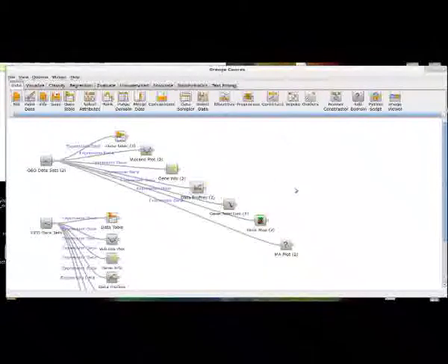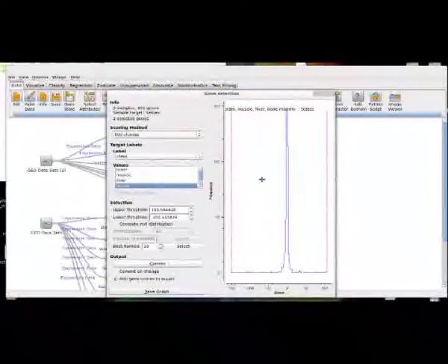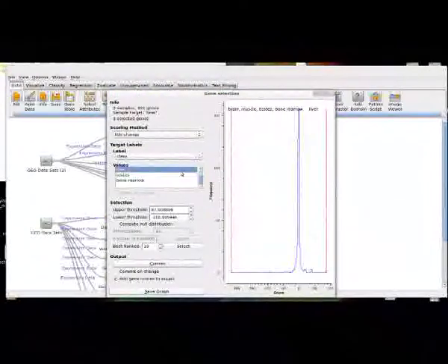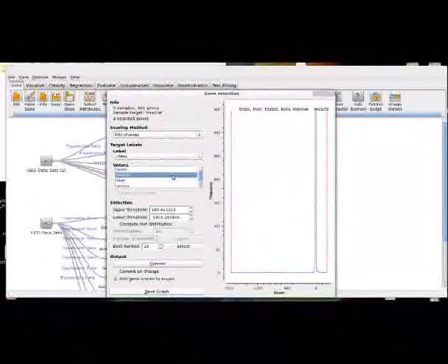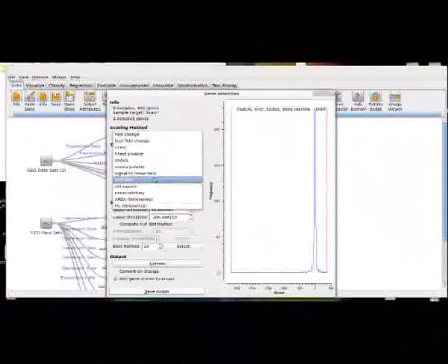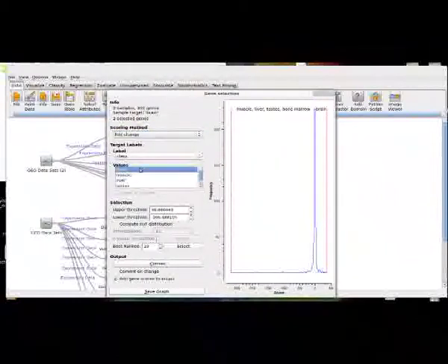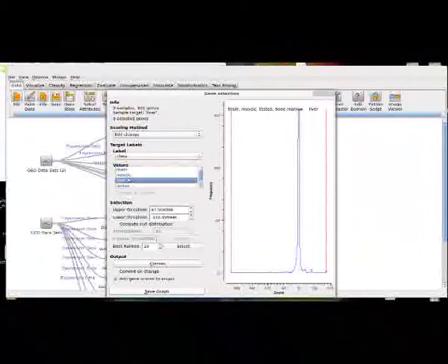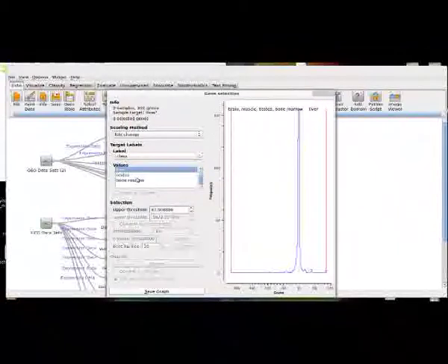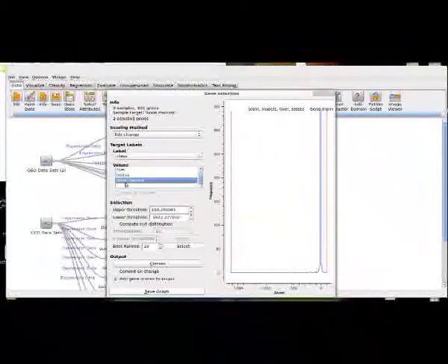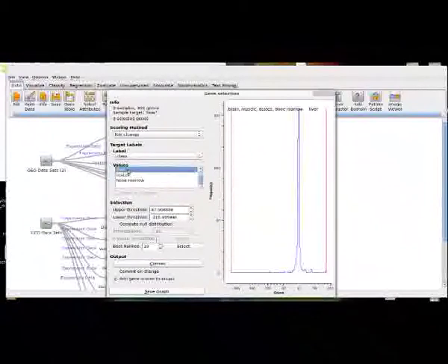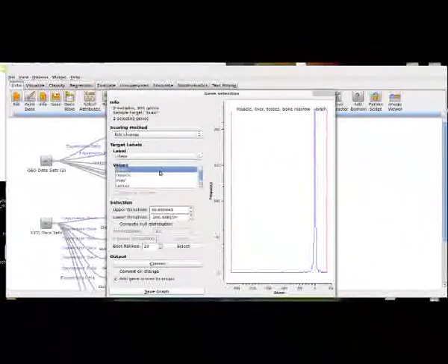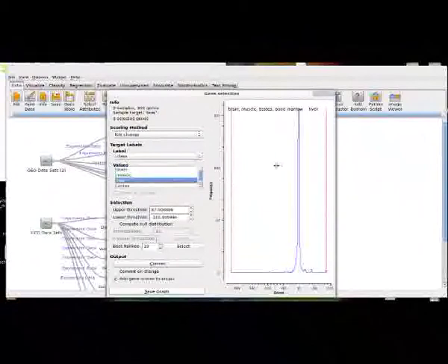So moving on, we're going to look at the Gene Selection widget, which is one of my favorites. So this provides you with examples of statistical significance, and you can use many different scoring methods for a particular gene in relation to its classifiers. One very interesting thing about this is, you'll see at the top, it says two selected genes when I'm looking at the bone marrow values. Testes is the same, liver is three, muscle is two, brain is two.